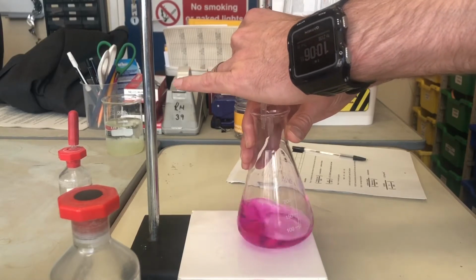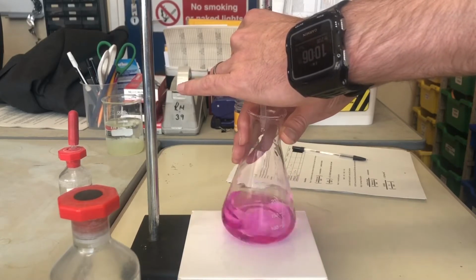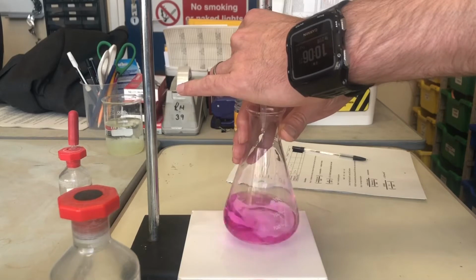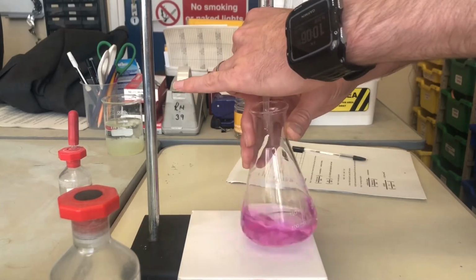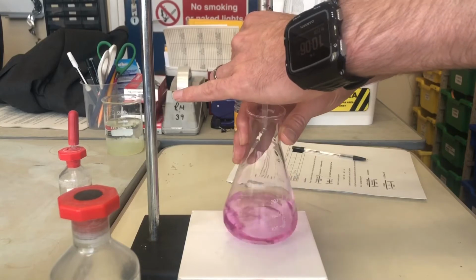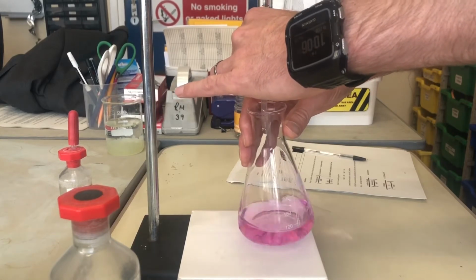Now it's quite a quick burette this. Now the phenolphthalein will go colourless when the neutralisation point is going on. It's getting quite close now. So you see it's going colourless. It's not quite there. I think maybe just one more drop. Let's give it a quick swirl. We'll see how the colour's lightened.